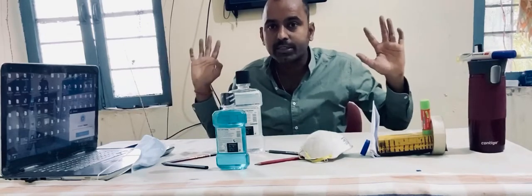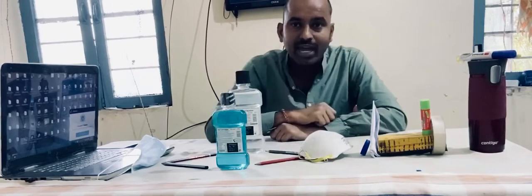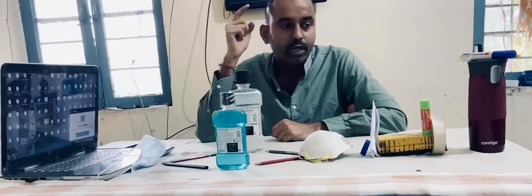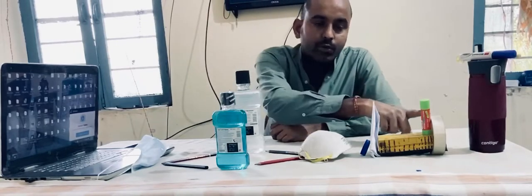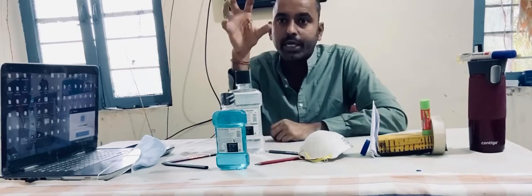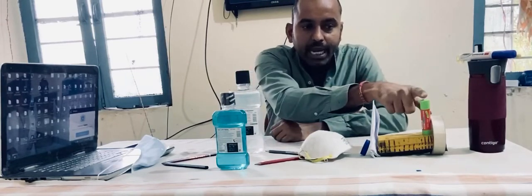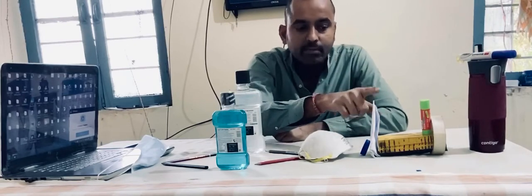So what are the components? Let me tell you one more time. The first component is your source of light. How many types of light sources are there? Two types: one is the line source, another is the continuous source. Again, this light is polychromatic in nature. It falls onto the collimator, which focuses the polychromatic light onto the entrance slit. Through the entrance slit, this polychromatic light falls onto the prism or grating.